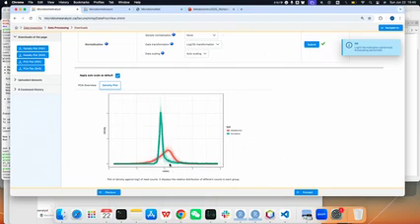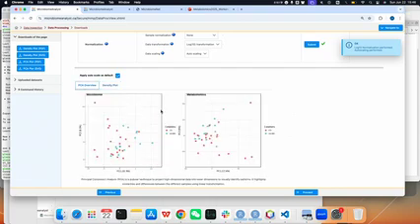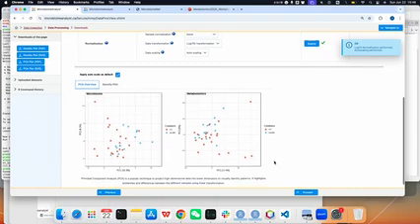Sometimes there are a lot of zeros in the microbiome data, and then you can see the peaks are quite separate, so it's not comparable. Here is a PCA plot, so we have a general idea of the data pattern in the different data sets. It's similar to what we have seen just now.